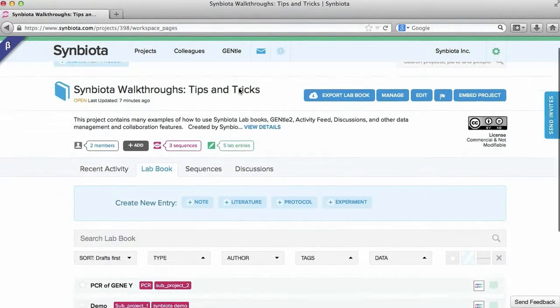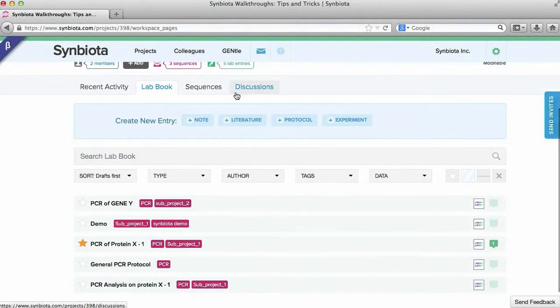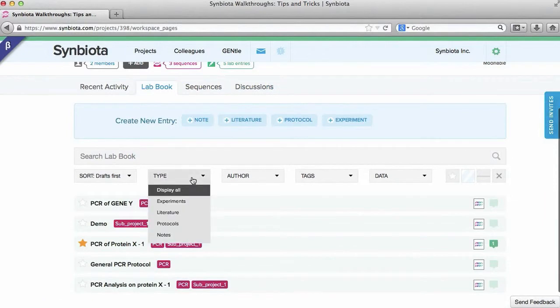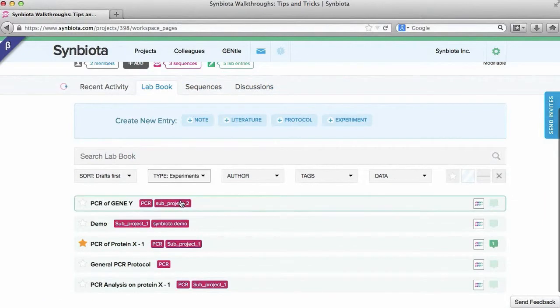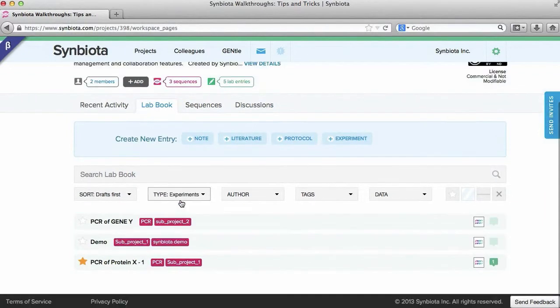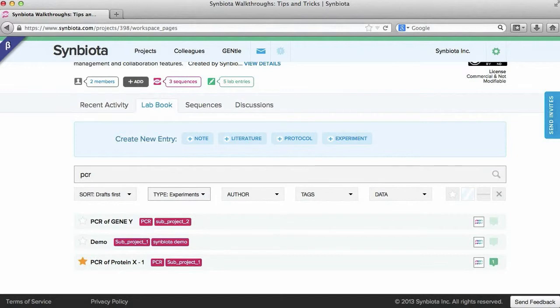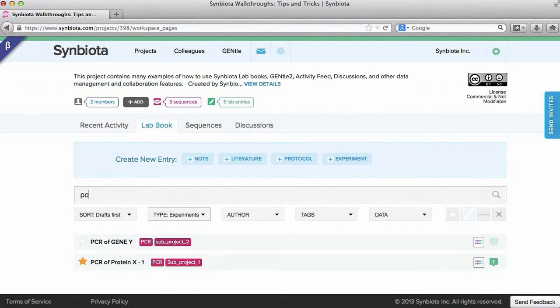If you use a sort feature such as entry type, text search is then limited to that sort feature. Use this to mine your data with much higher precision.